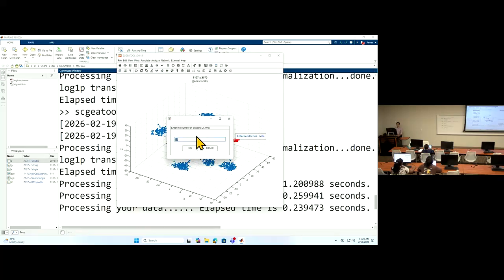And here you see how many clusters you want to make. This number is all pre-computed based on how many cells you have. I will group every 50 cells into one cluster. So I just divide the total number by 50, and so at the end you will get a lot of small clusters. Each contains about 50 cells.